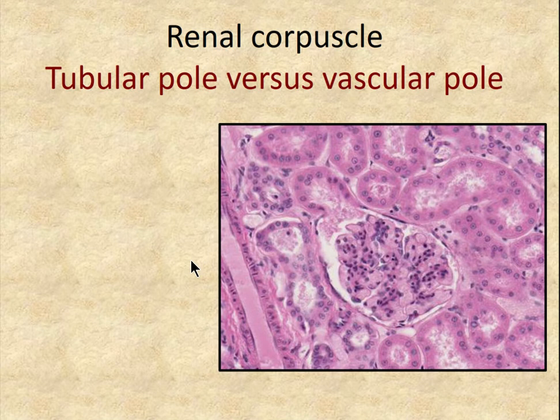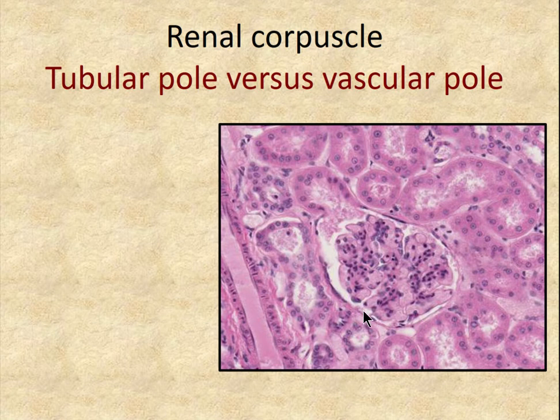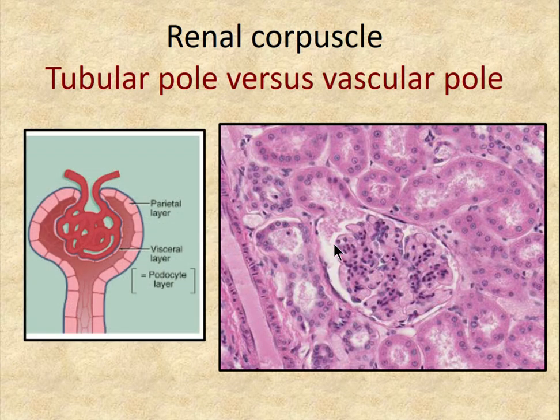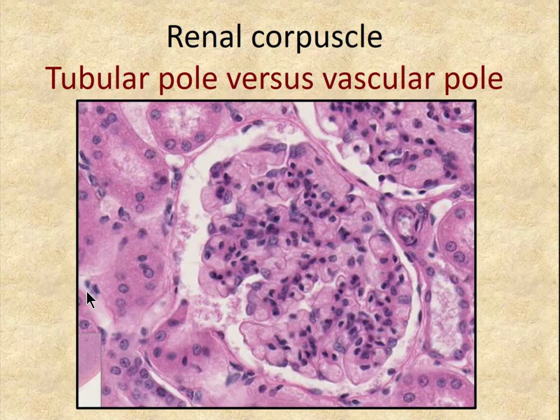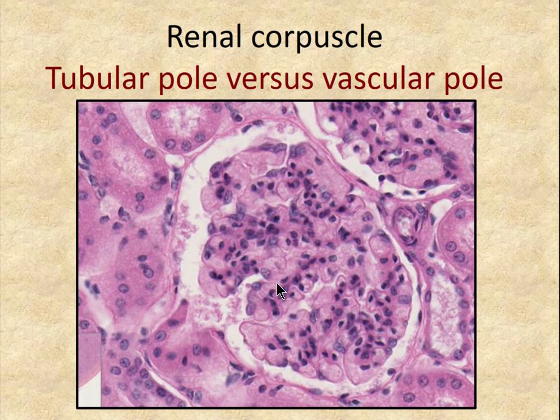The renal corpuscle has a tubular pole and a vascular pole. The tuft of glomeruli sits in the center surrounded by Bowman's capsule — the visceral layer directly on the glomerular capillaries, the parietal layer on the outside, with urinary space in between. The tubular pole is where the urinary space becomes continuous with the proximal convoluted tubule. The vascular pole is where a small afferent arteriole enters, visible with a red blood cell inside.